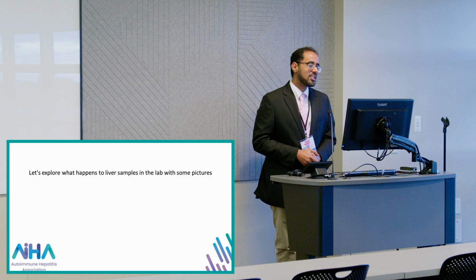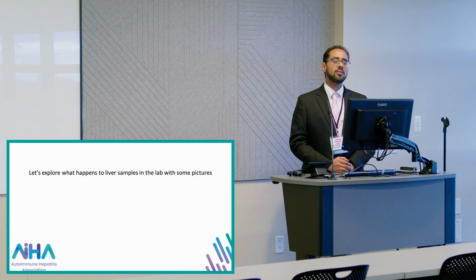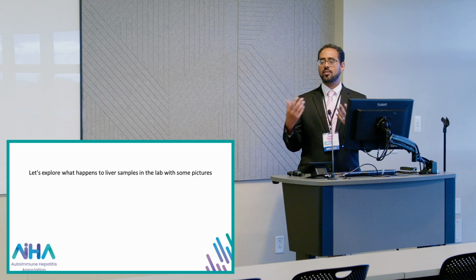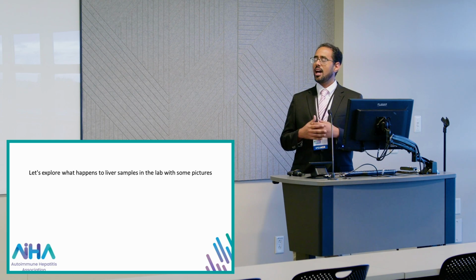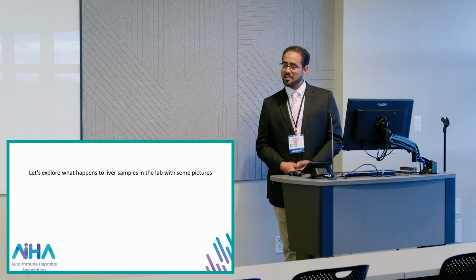Okay, sorry about that. So now we're going to talk about what happens to the liver when the radiologists take it and send it to the lab. So I'll take you on a journey so you can see what happens and why the pathology report takes a few days to come out, okay?